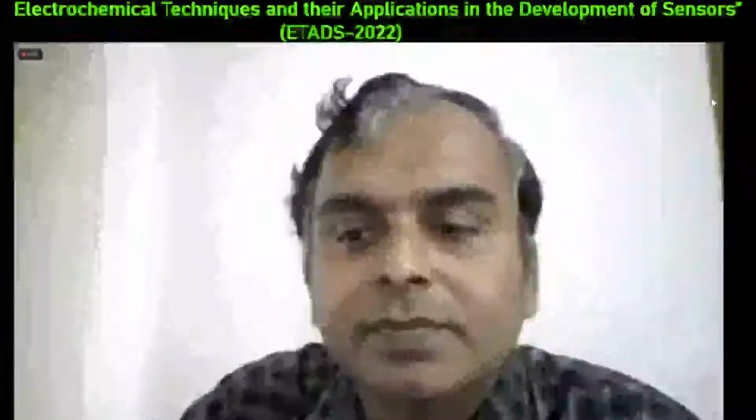Okay. And then there is another question on using toxic elements like tellurium for an electrochemical sensor. Yes. In that case, we didn't try tellurium. We tried some electroactive heavy metals like copper or mercury, chromium as well, but not tellurium yet. And then we also applied indirect amperometric detection for anions, non-redox anion detection, or electrocatalysis.